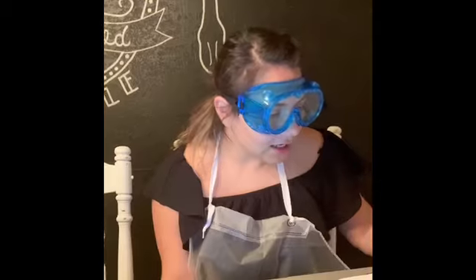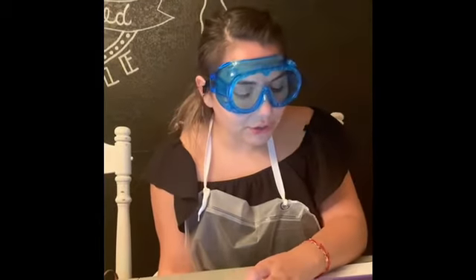I'm gonna go over data table 2 in another video, but I hope you guys liked it. Thank you, guys. We're back with this video, lab 6 experiment, determination of acetic acid concentration in vinegar using titration. So for this one, I'm gonna go over data table 2, the titration of the second vinegar sample with sodium hydroxide.